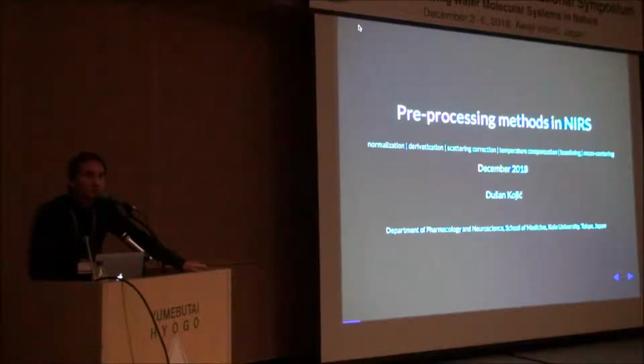And a lot of times, near-infrared spectra. So obviously, I'm working with near-infrared spectra. I took a short look at the posters there. I've seen posters in UV, in mid-IR. I think that's about all the techniques. Is anybody using anything else? So I guess mid-infrared, UV. I'm not familiar with UV, but I understand IR, and I'm going to try to make my talk as broad as possible. I'm going to emphasize what is specific to NIR and what is not.